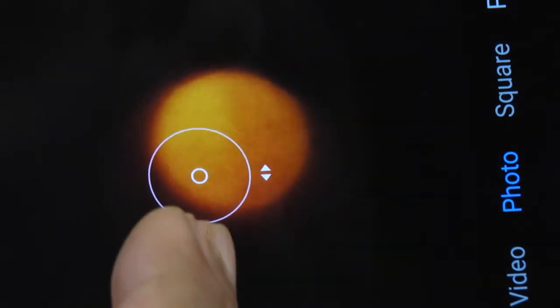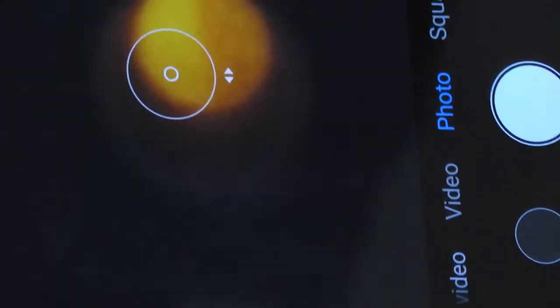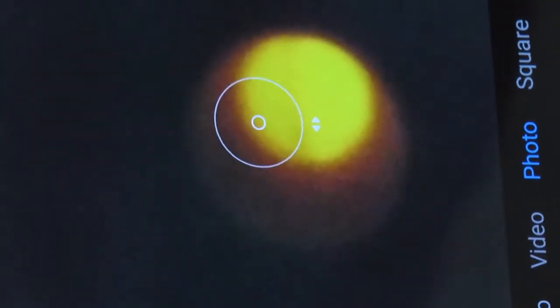Now I am in original position, it seems 0. Okay, this other half I got dark and bright. Anyway, I think just quickly I will rotate and see the variation of this uniform.